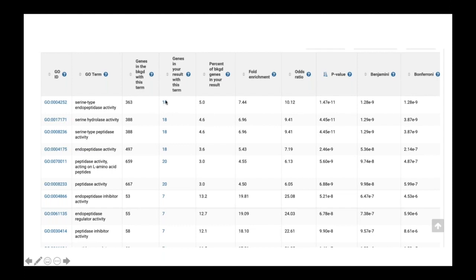And again, for each of these, for example, 18, there's a probability of it appearing not by chance, or probability of it appearing in your sample. And for all 18, each one of them has a probability. So this is an overall p-value for what are the chances of all of these appearing in your sample. And you'll see here that this is a pretty good p-value in this case. So you would say, well, this is significant.